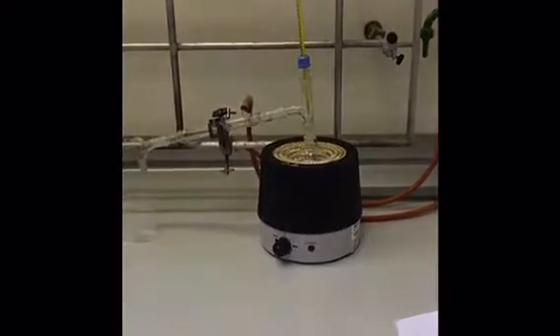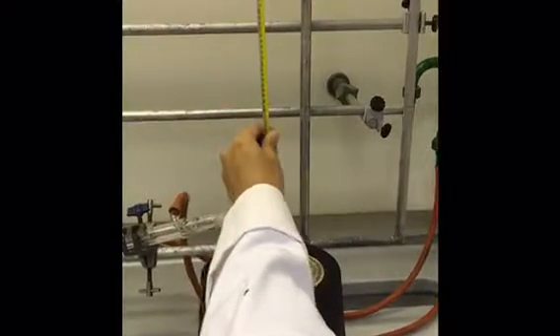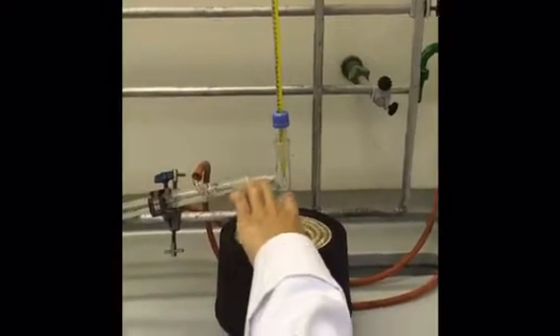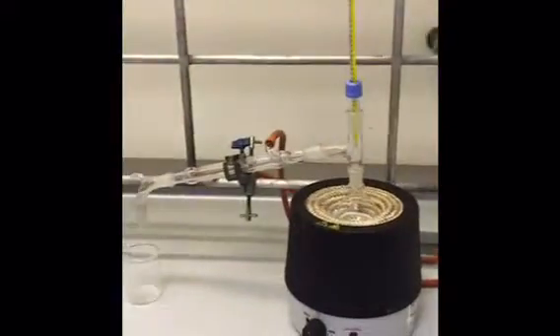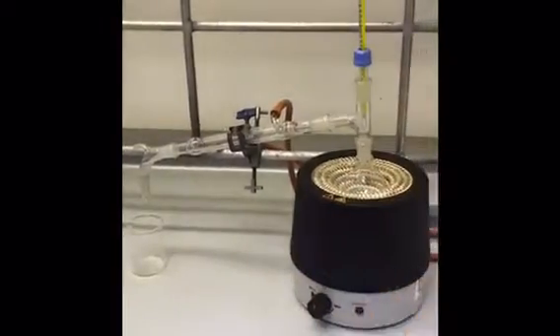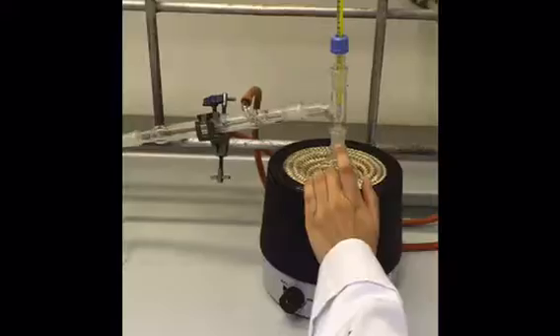So I've clamped that solid and steady. The thermometer goes in there, but I would take this out to put the mixture in using a funnel on the top. And then once the mixture is in, I put the thermometer back in. I would add 2–3 anti-bumping granules first, and then I would start heating it up and turn on the water.